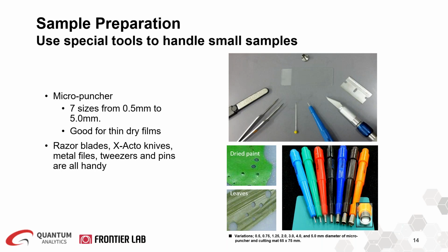Like Rosine says, it really depends on the GC methods that you're studying. For EGAs, I typically run the sample from 100 to 700, ramping about 20 degrees C per minute, and it takes me about 30 minutes to complete the whole run. The thermal desorption for EGA has to really match the GC method, so it's about 30 minutes.